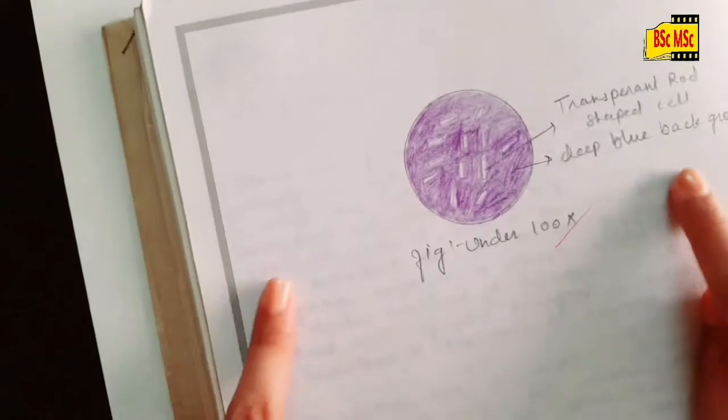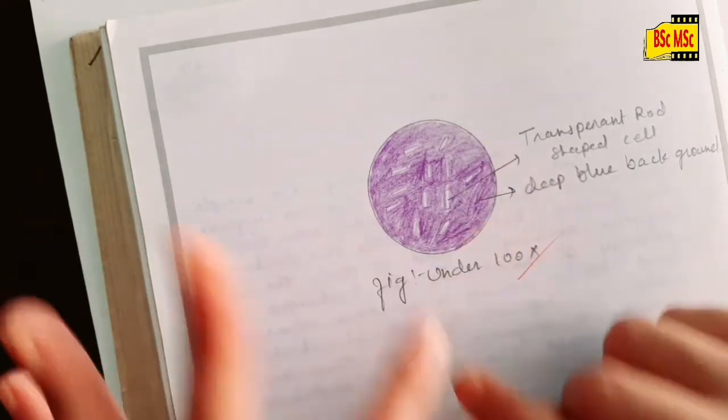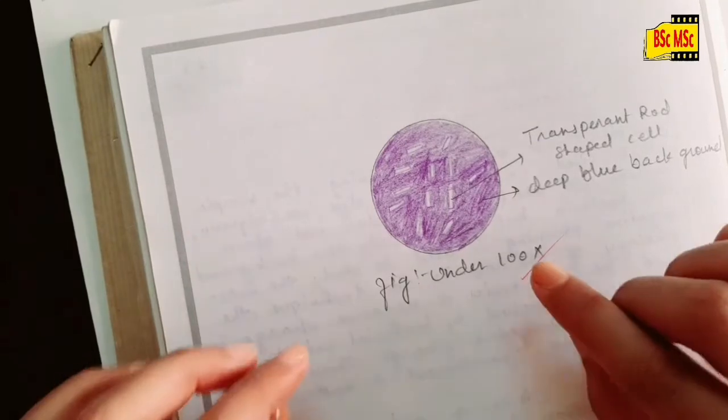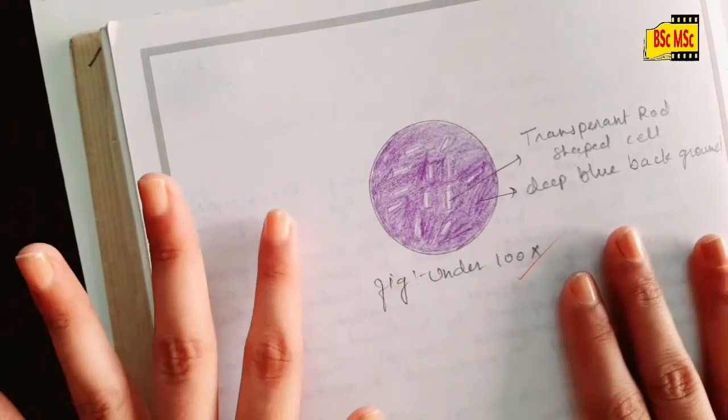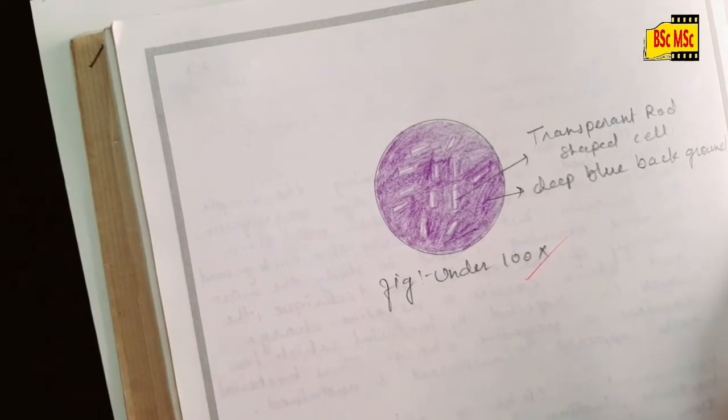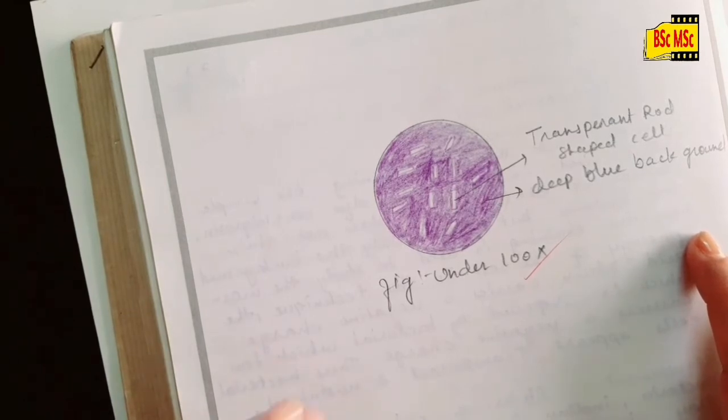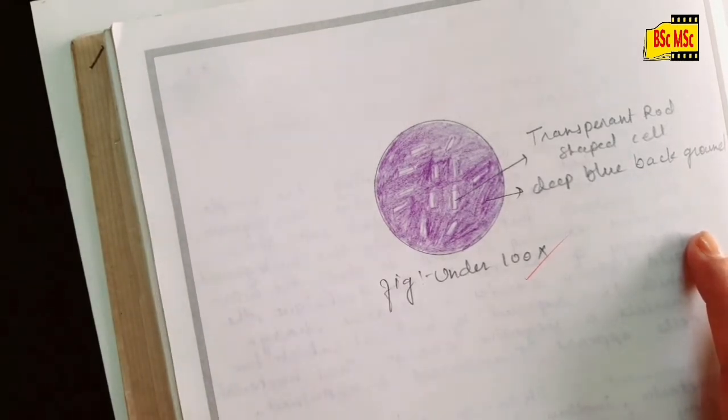See, this is my observation. When you observe it under 100x under oil immersion, you'll be able to see the transparent bacterial cell. This negative staining we basically do to see the morphology of the bacterial cell - how long it is, what is the shape of the bacterial cell.